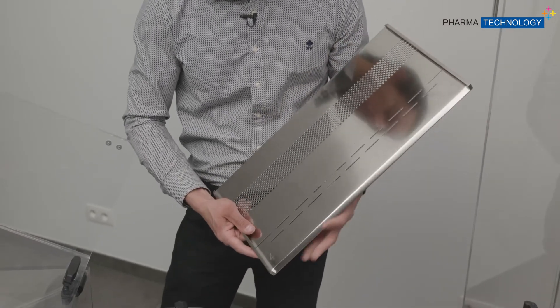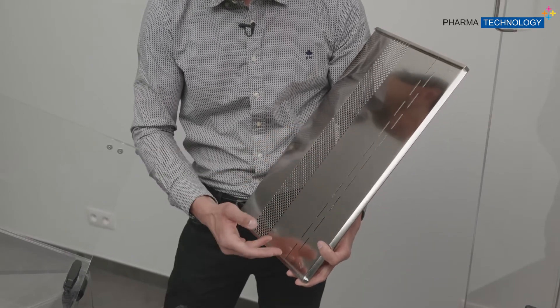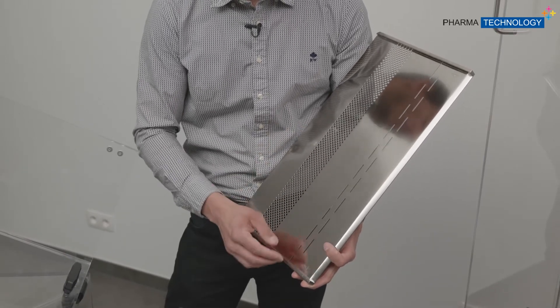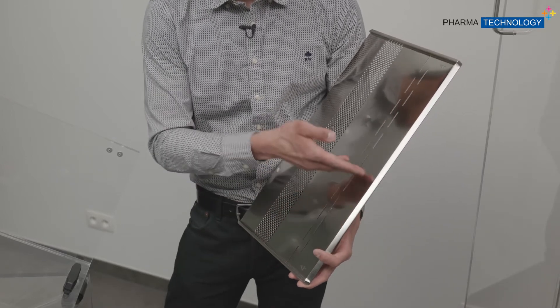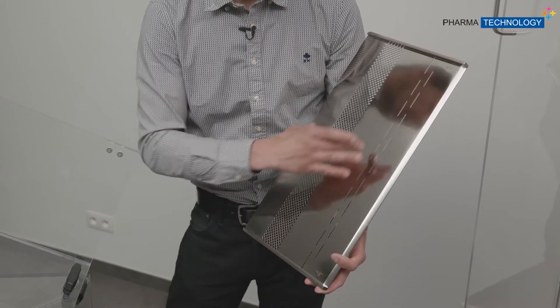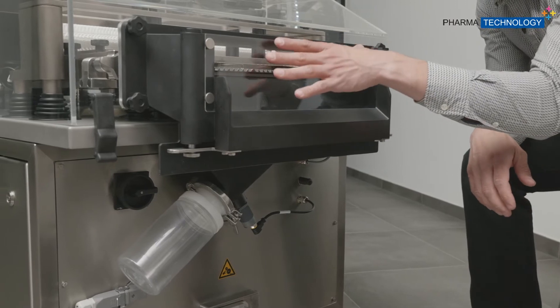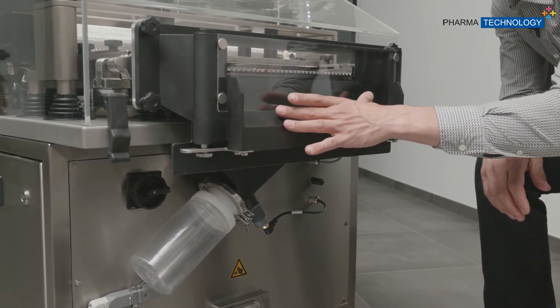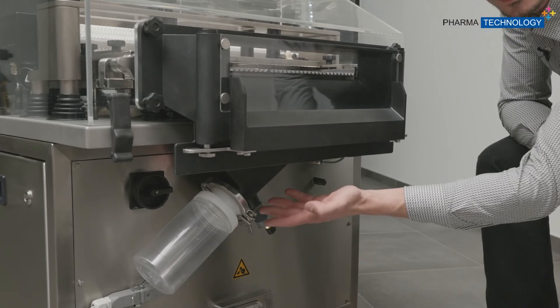If we take a closer look at the format part for broken tablets, this is how it looks, and this is the area where we will do the sorting. When you choose the option of capping sorting, it will be here in this area, and the roof will be in this zone. We can see here the area where the good tablets go, and here the area where the broken and capped tablets will be rejected.